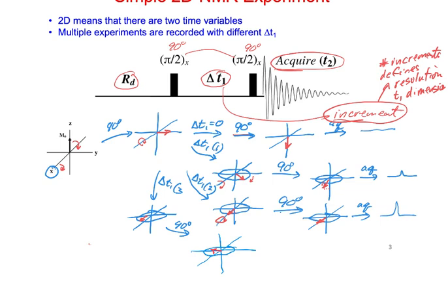Because it's pointing out this way, and when we do the 90, it's going to rotate up like this, right? Before it was pointing this way, and we rotated down. So it's going to have some component in each of these directions, right? So then we're going to do our acquisition, and we're going to get a smaller peak again. And I guess we do set the phase, because if we go beyond, like, precessing around 180 degrees, then we're going to end up with the negative peaks.